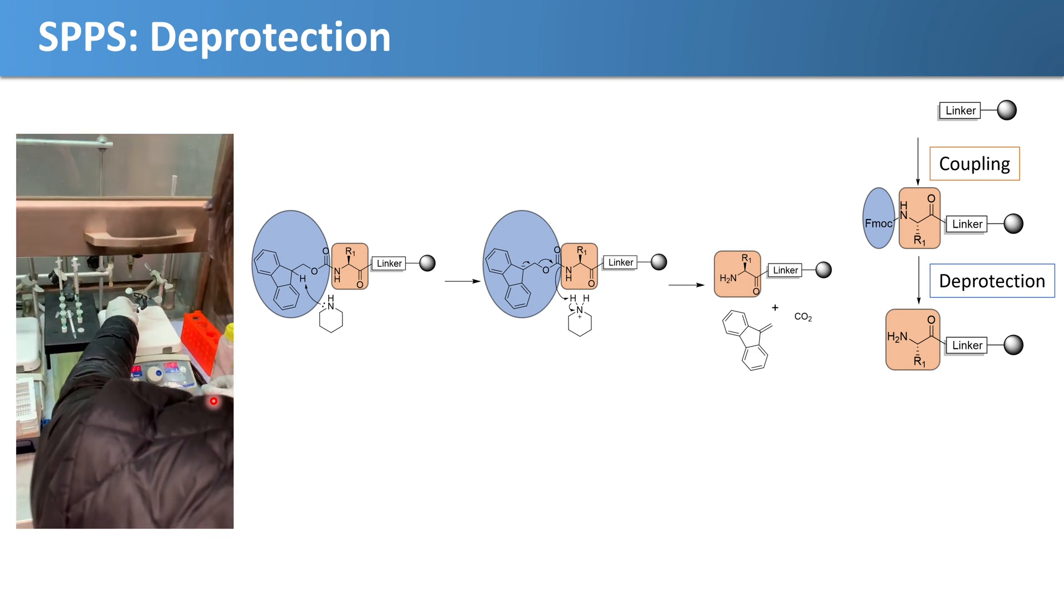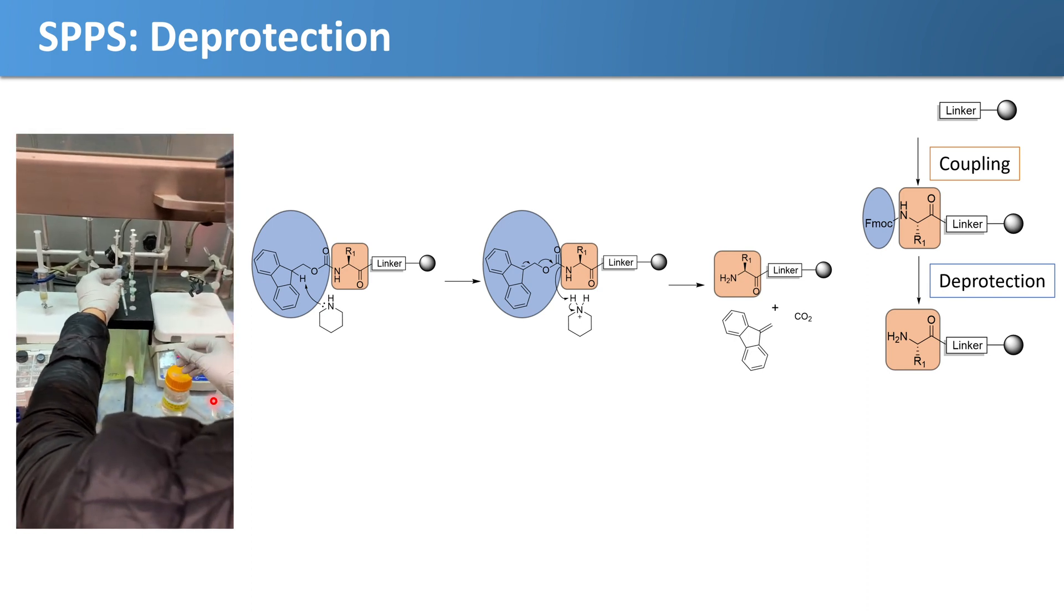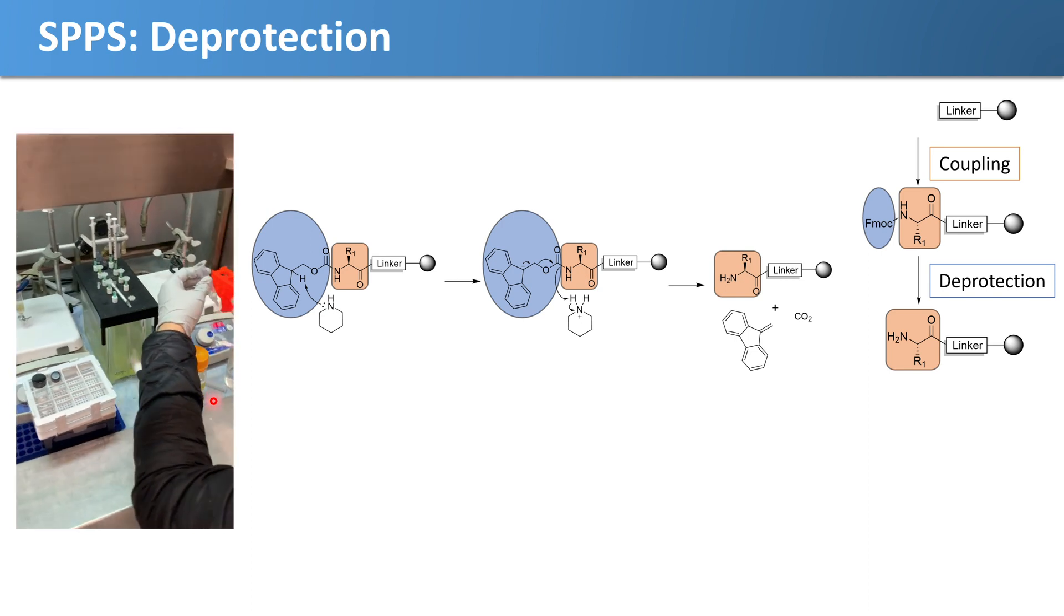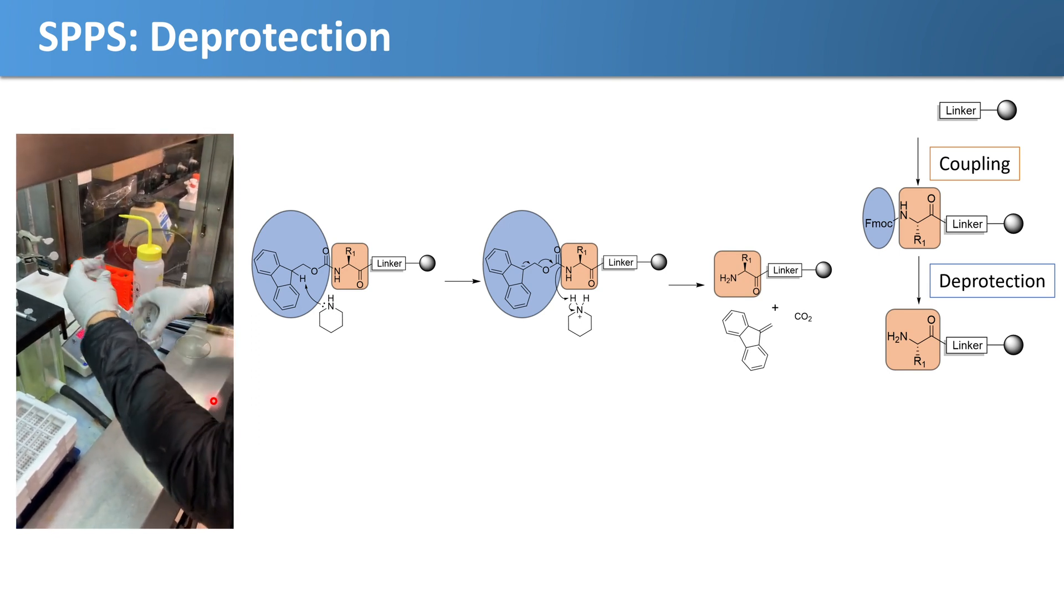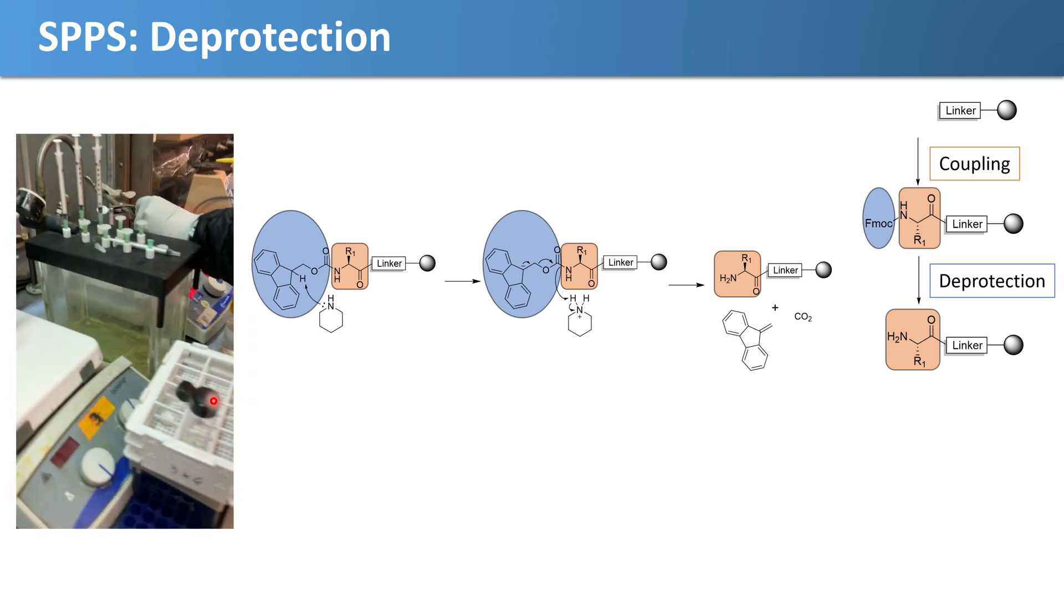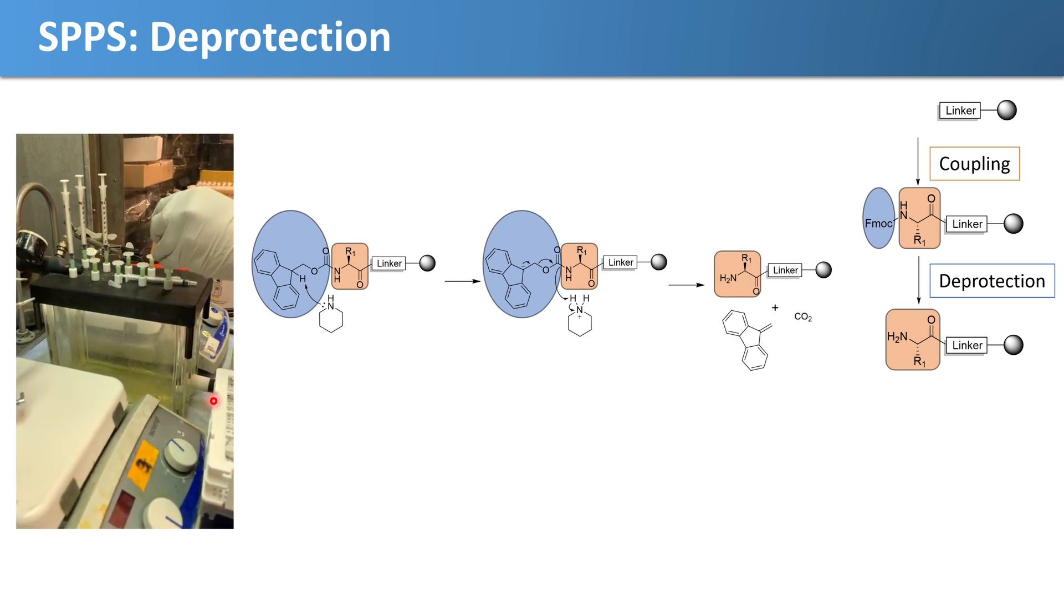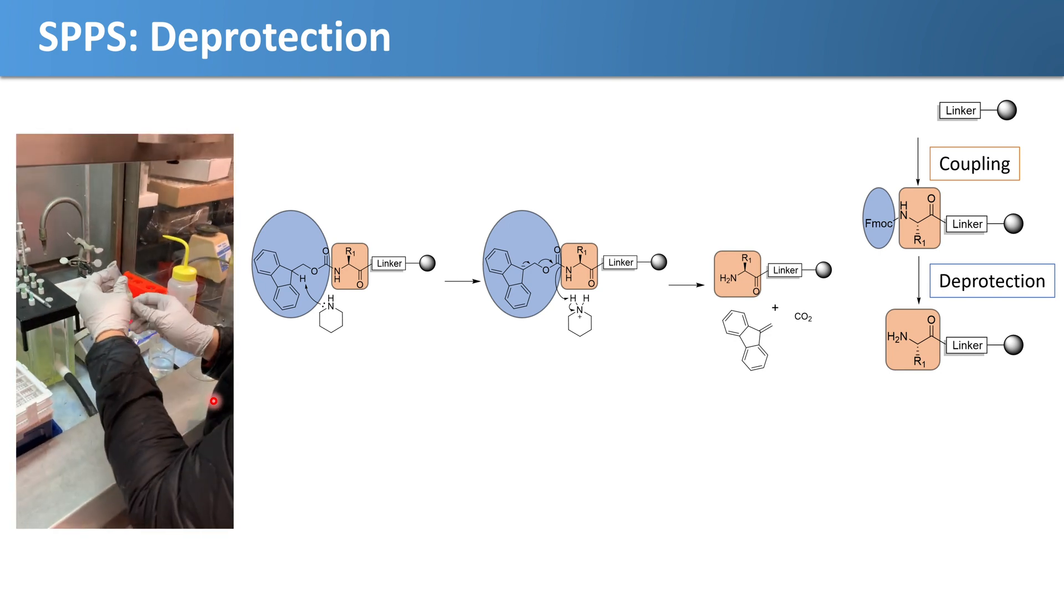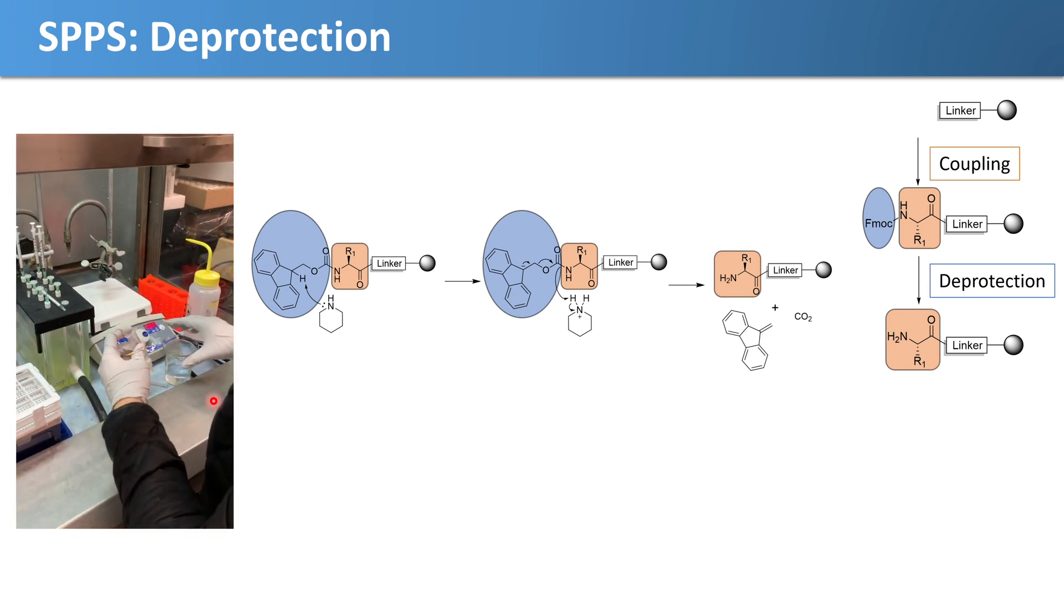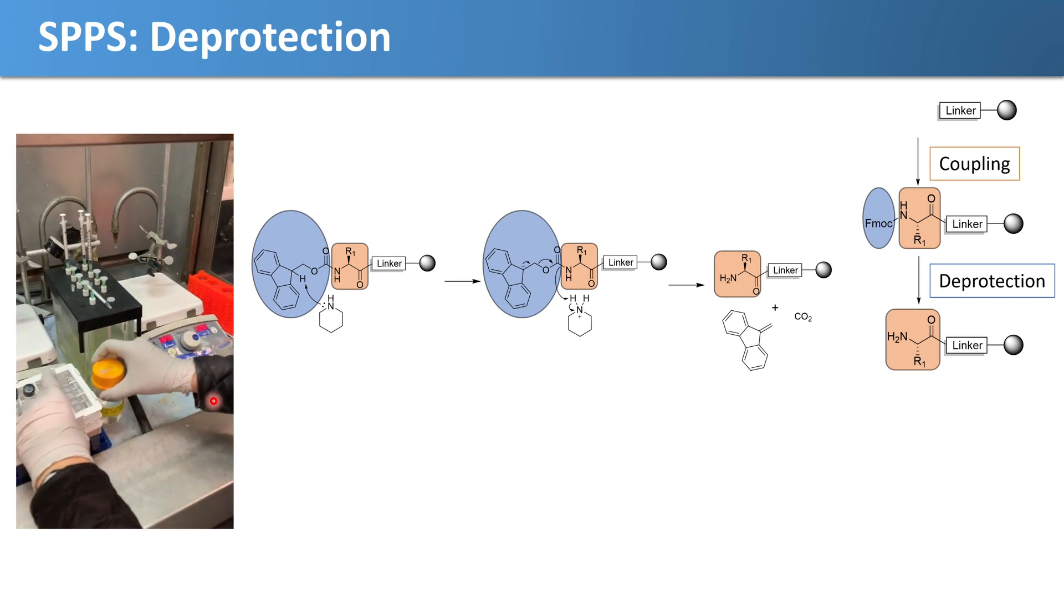You can see her putting it on the stir plate there to make sure that it's stirring and mixing. Then she drains and is ready for the next wash, which is DMF. Now in the reaction vessel is just the solid support and we are ready to begin our deprotection.